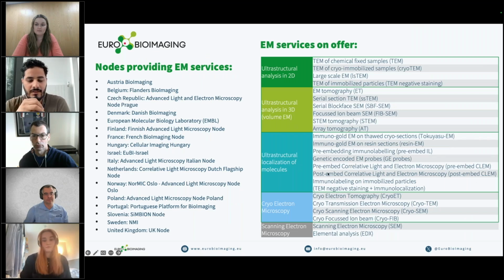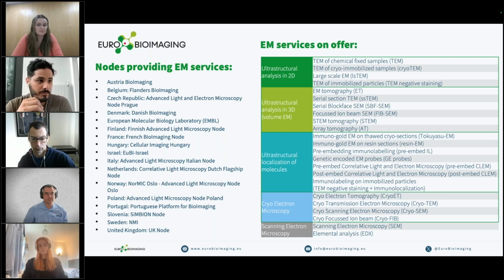As you can see here, we have the list of our nodes that provide access to electron microscopy services. As you can see, they are really distributed across Europe. And you can see on your right that we offer access to a really wide and broad service portfolio when it comes to electron microscopy.